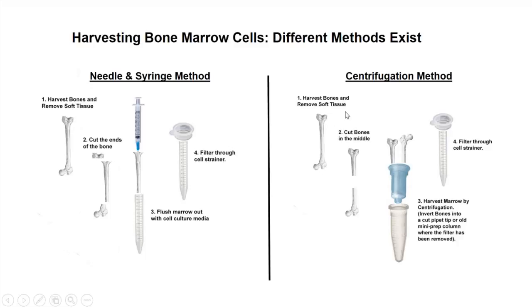We take our femur and isolate it, but instead of cutting it on the ends, we cut the bone in the middle and then invert the bone into a holder. Since we do a lot of DNA work in our lab, our mini prep columns often expire, so we'll pull out the filter of a mini prep column and stuff our cut bones in there. An alternative would be to use a pipette tip, cut the tip off, fill it with a couple bones, drop it into an Eppendorf tube, and centrifuge out the marrow. Typically, I'll add 200 to 300 microliters of media to the Eppendorf tube and then centrifuge it out.